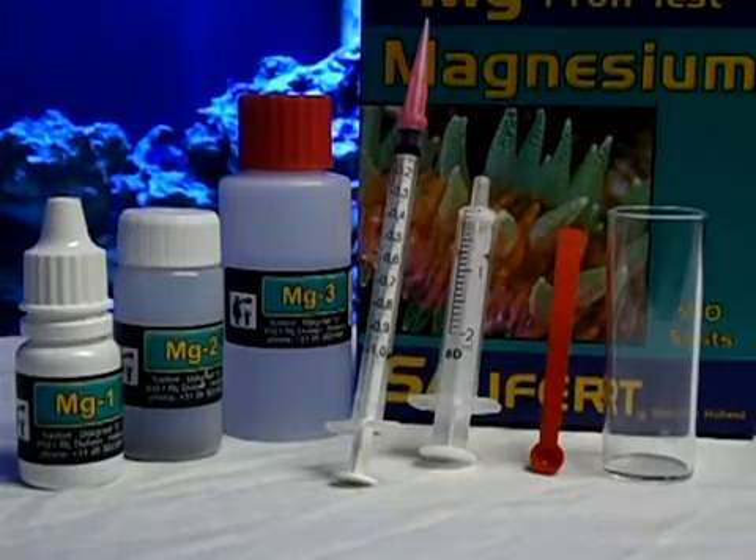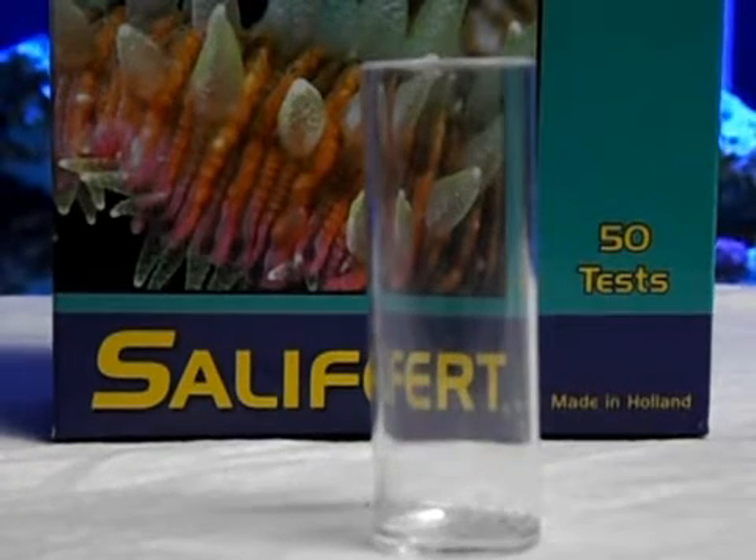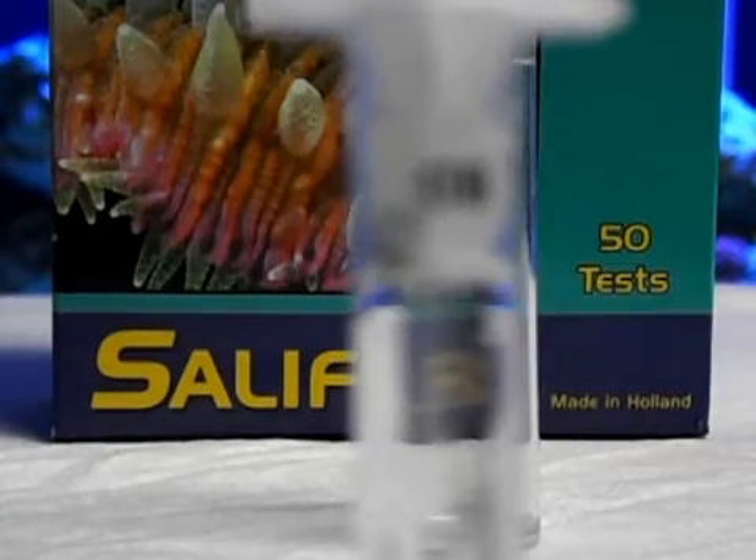Before you start your test, you want to make sure you have all the items in your kit. The first step is to get two milliliters of the water you're testing into the two milliliter syringe.